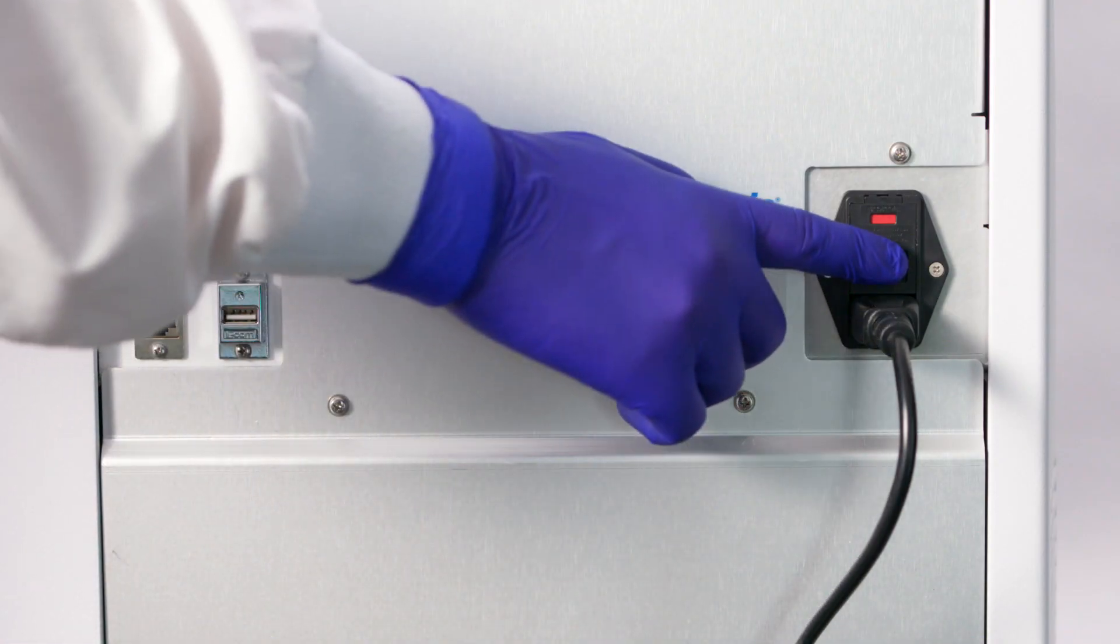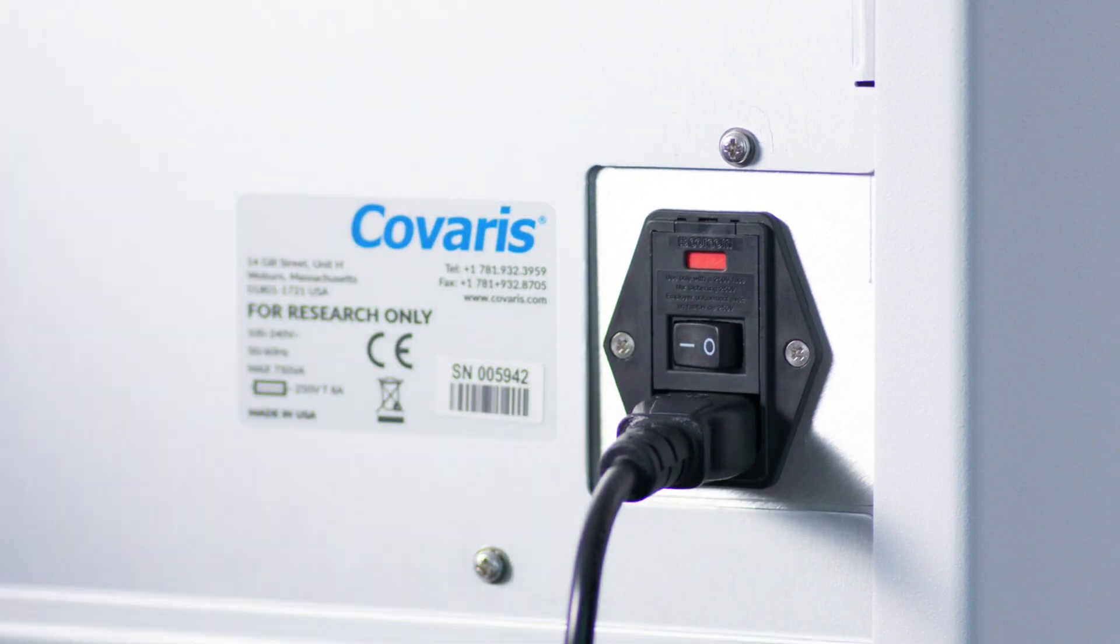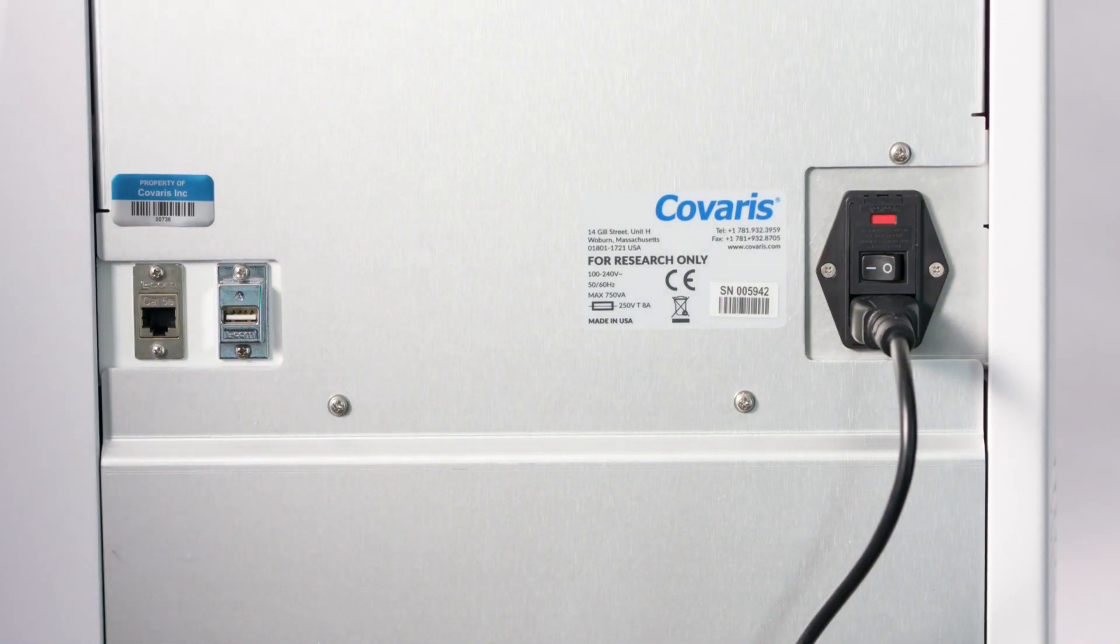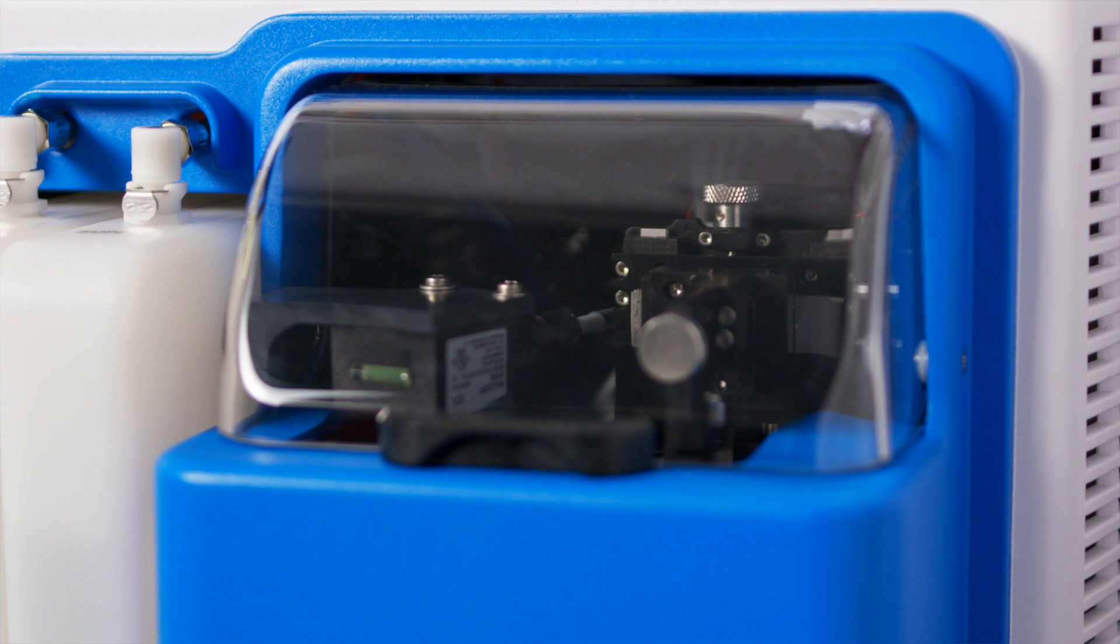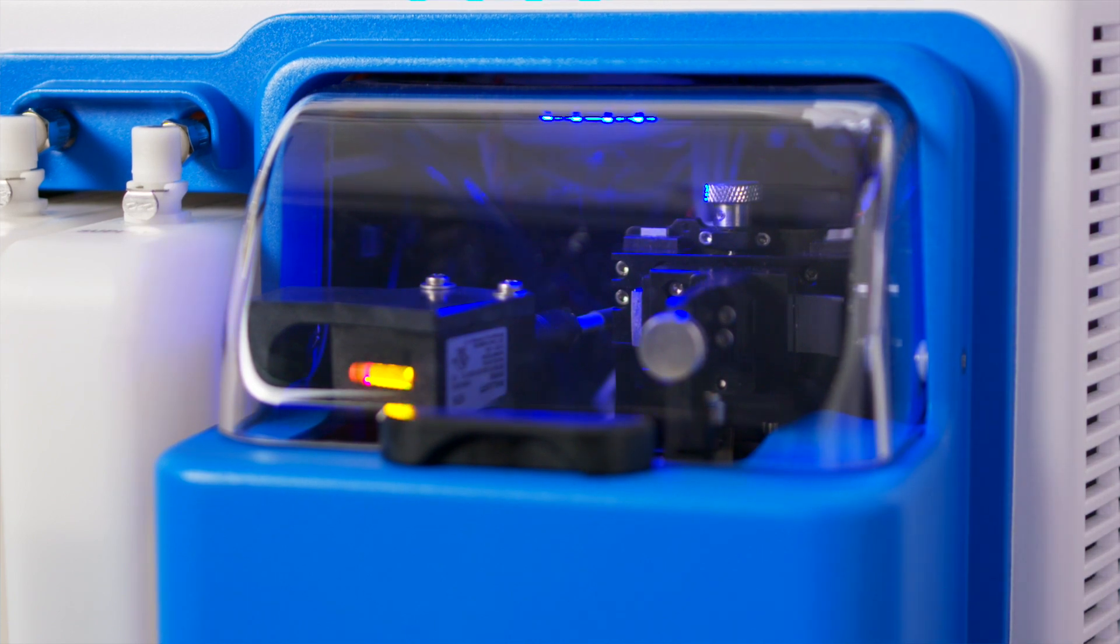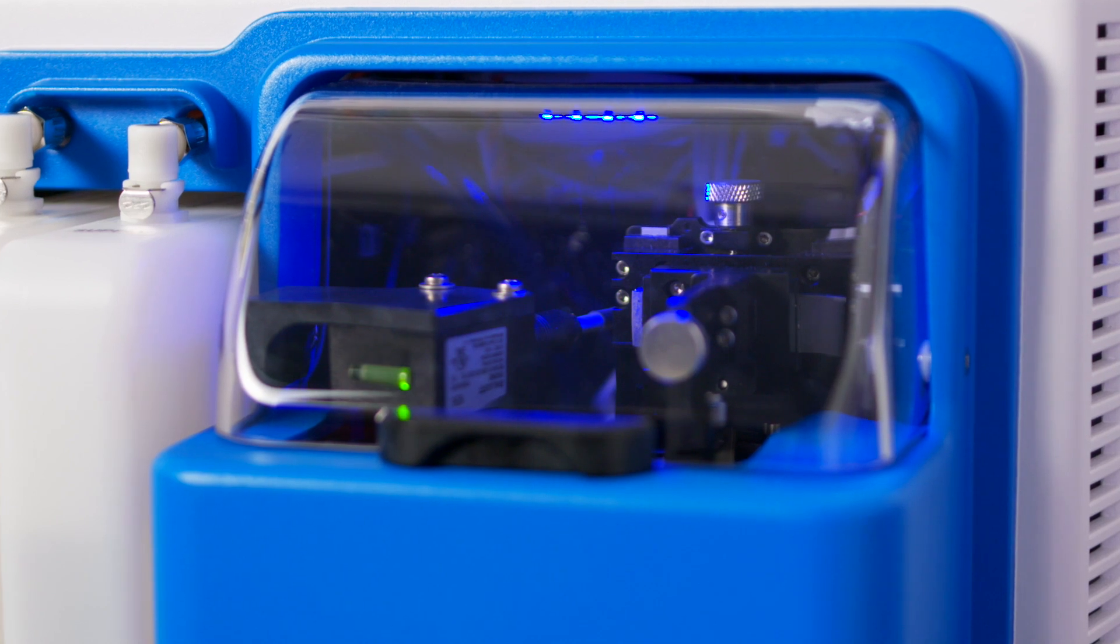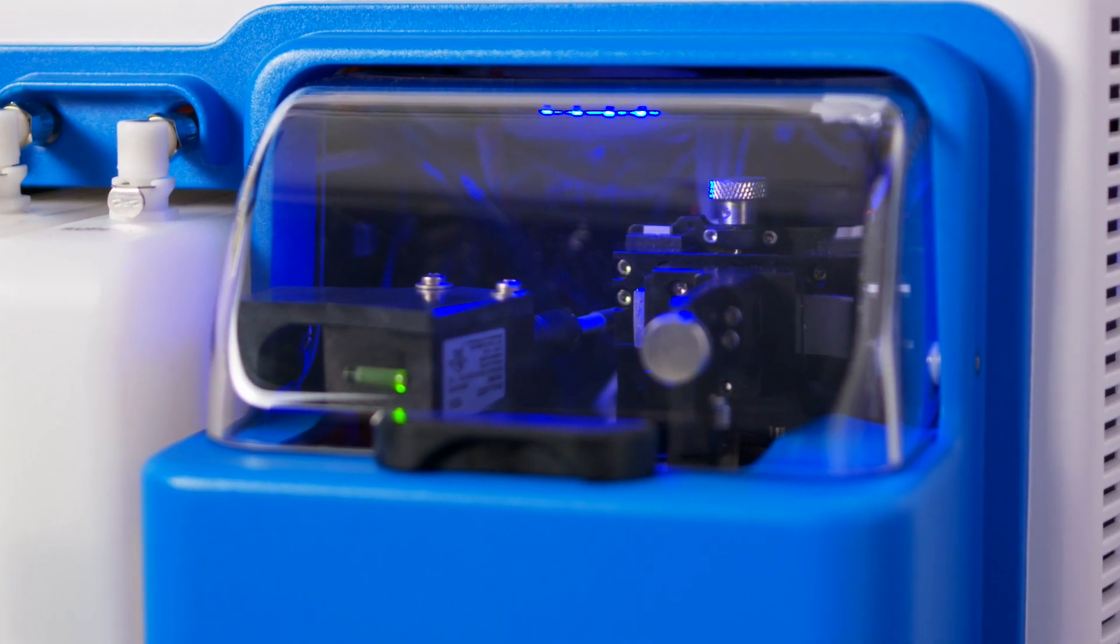Turn on the ML230 using the power switch located about halfway up the left side of the rear panel. The instrument light is located above the acoustic assembly and is inside of the safety cover. By default, the light will be lit once the instrument is turned on.